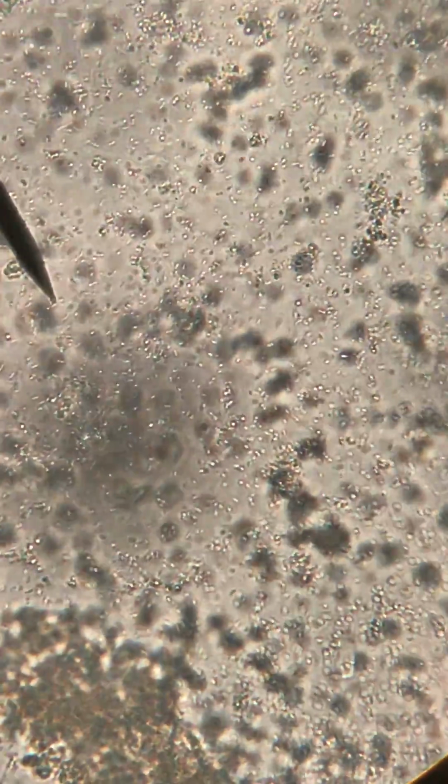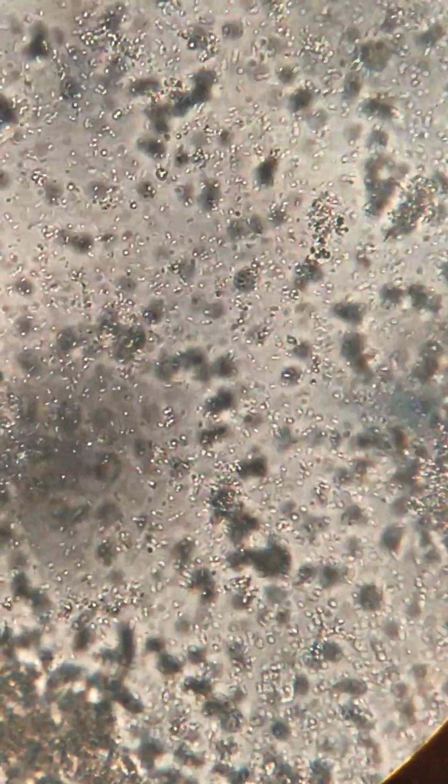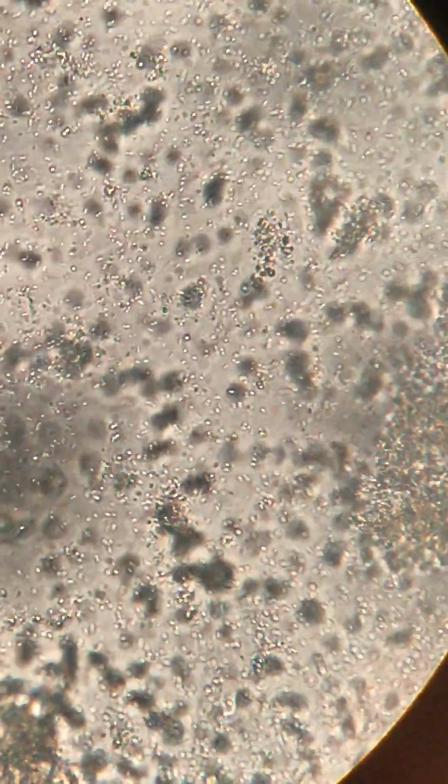So all of those things moving back there are bacteria, and it's actually a type of bacteria called Lactobacillus acidophilus. And what's really cool about bacteria is that they come in different shapes. Some of them are rod shaped, some of them are sphere shaped, some of them are actually spiral shaped. And you don't even have to actually see the bacteria to know what their shape is. You can actually just look at the name of the bacteria. There are certain Latin word parts that will give you a hint as to the shape of the bacteria. So I may share that with you a little bit later.